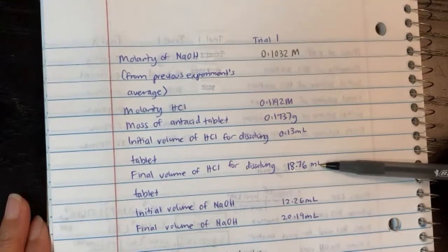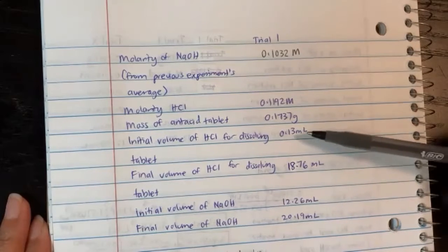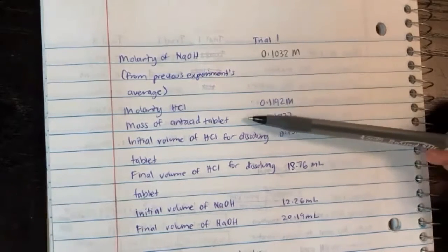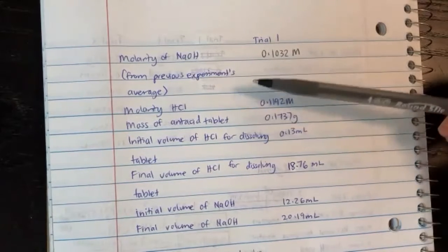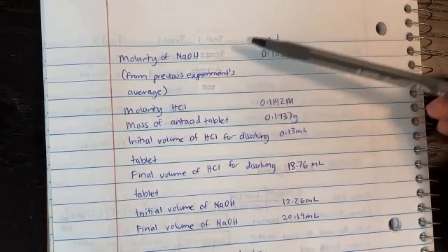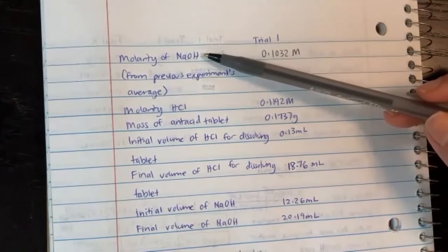Now, the theory behind this experiment is basically we are using sodium hydroxide as a base. Antacid is also a base because antacid works by neutralizing acid. So antacid could be neutralized with any acid, right? But the problem is, we're going to use NaOH to try to neutralize the HCl antacid.